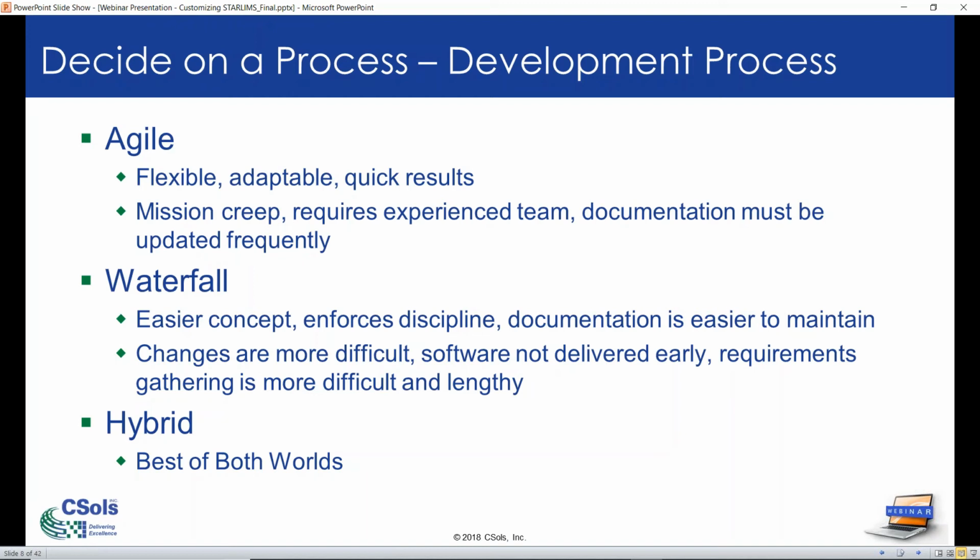Most likely, you will use some hybrid of the two processes, with a development cycle that leverages an agile approach, while the final UAT and validation steps may be controlled in more of a waterfall method. I've worked on projects that have switched more than once, where we started with a lengthy requirements and design phase that were executed in turn, followed by repeated development sprints, and completed by testing and validating in sequence. So there's lots of wiggle room as long as everyone is on the same page.